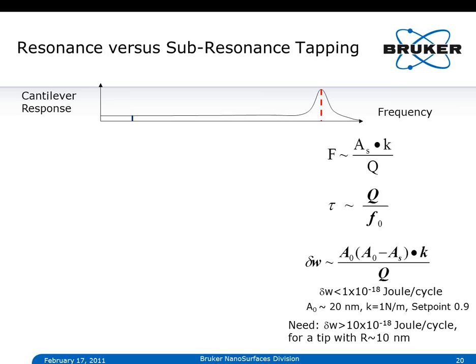And one thing we have not talked about up to now is that when you work in air, you often have an adhesion layer on your surface. I mean, the moment you have a hydrophilic surface, you have a strong adhesion on your sample. And we're using our tip cantilever here to actually establish feedback. So meaning our tip cannot get sucked into this adhesion layer. It has to have enough energy to get out of the adhesion layer at each cycle.